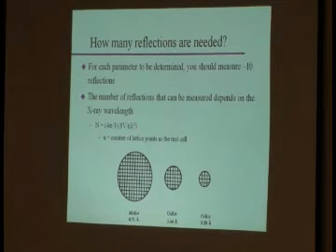Now, this takes into account absences from lattice centering. Okay, because the number of lattice points corresponds to C centering, F centering, I centering, right? Do keep in mind, this is the maximum number of reflections that you could theoretically measure.